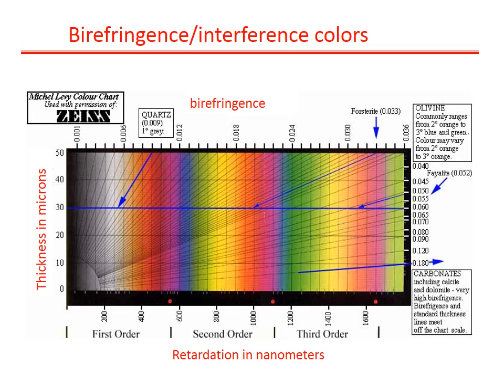This is harder to do in a rock without quartz, and other index minerals have to be used instead. You should also consider calcite. Calcite has such high birefringence that it's completely off this chart. It's way off to the right in these very, very high pastel colors.